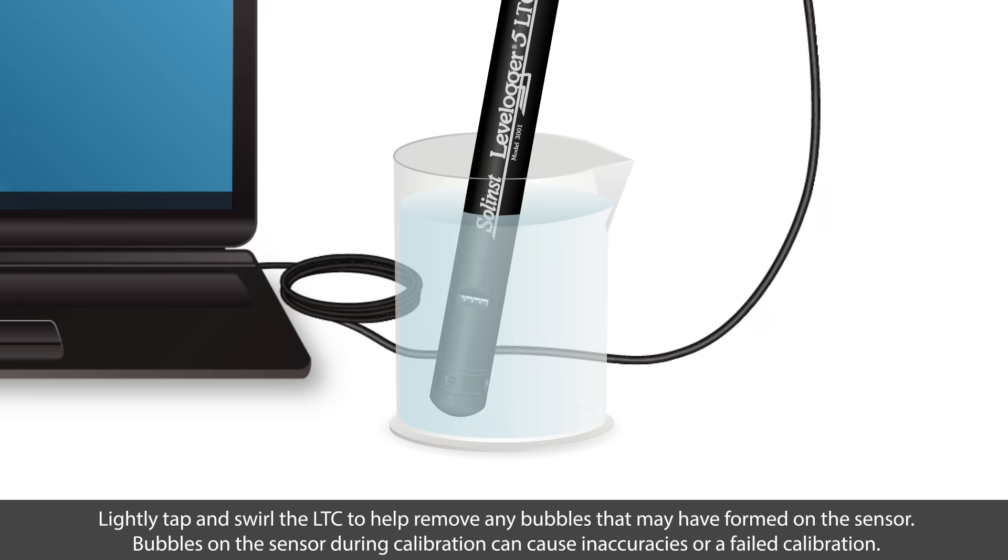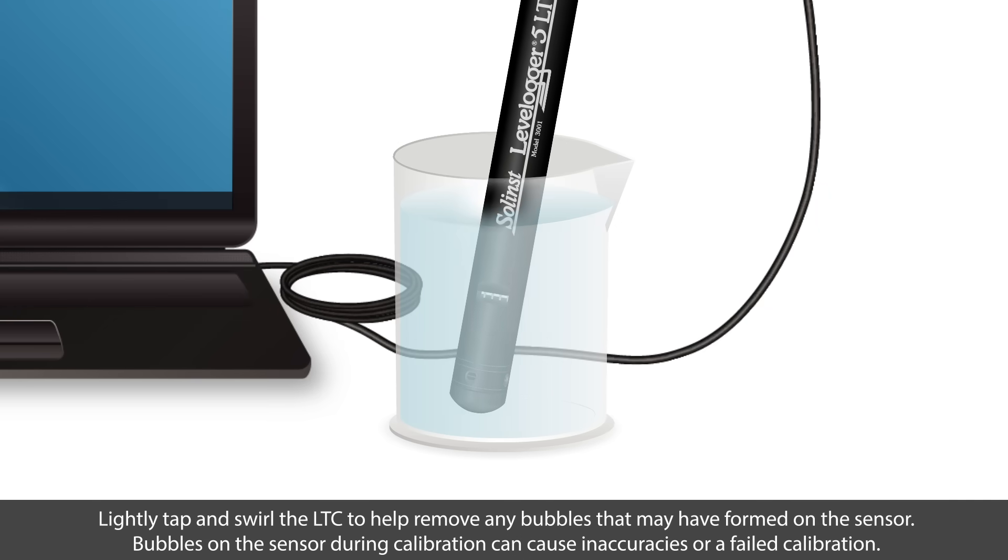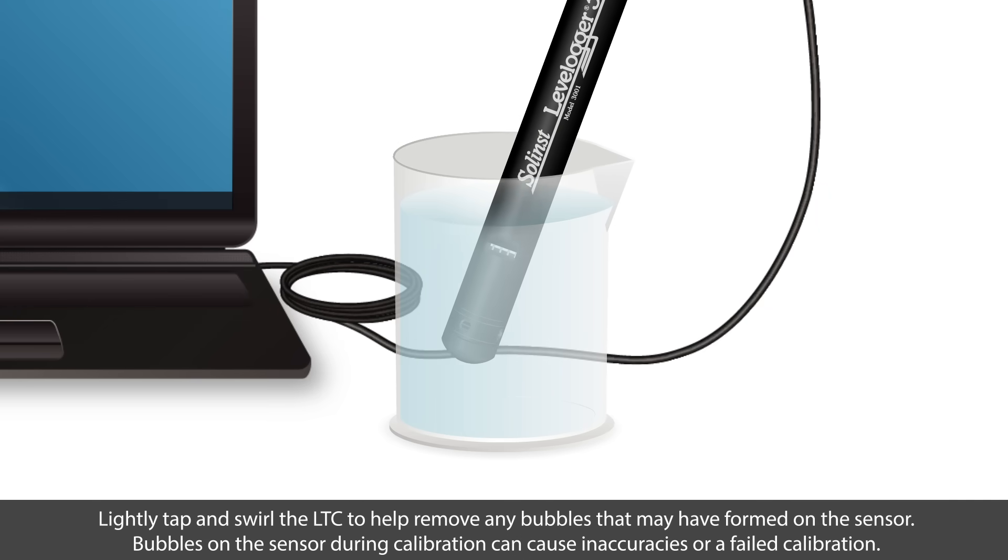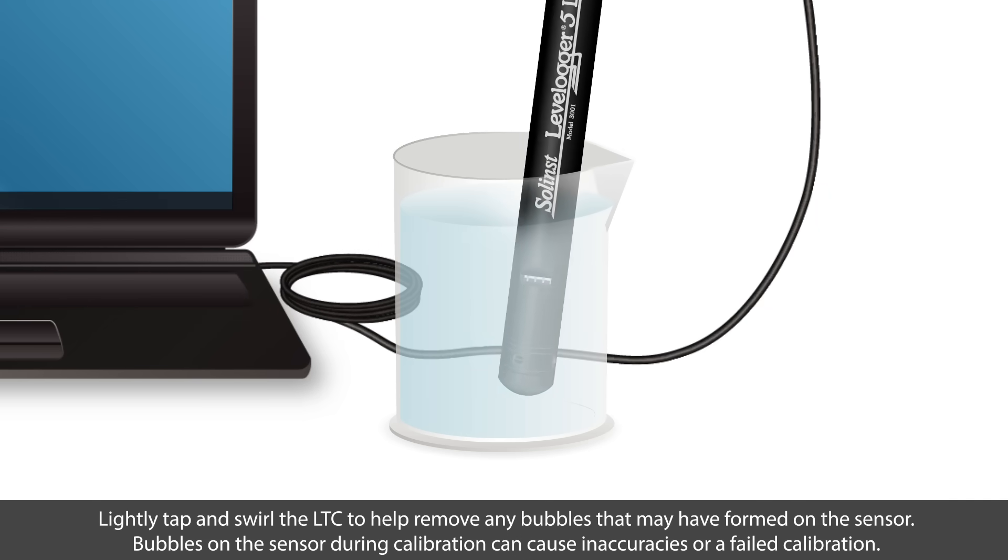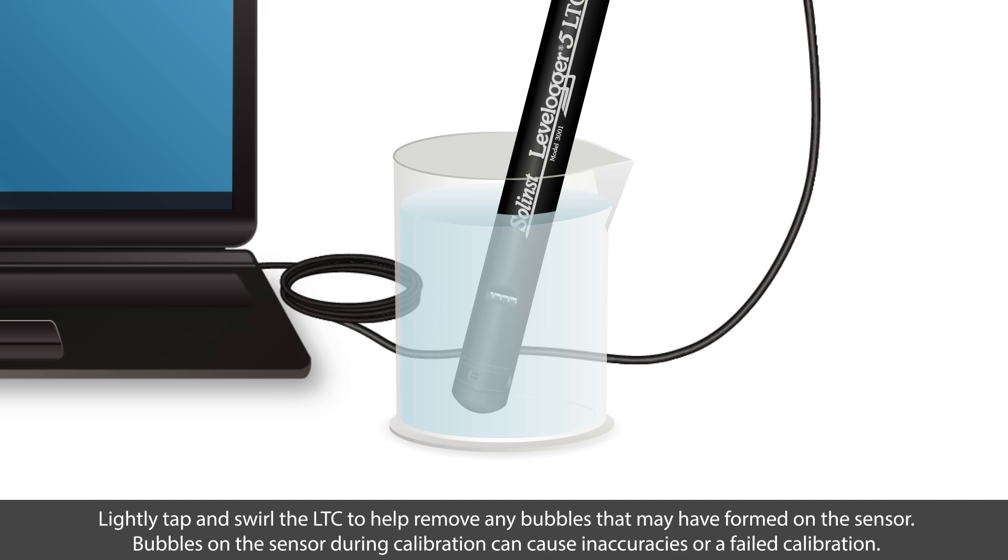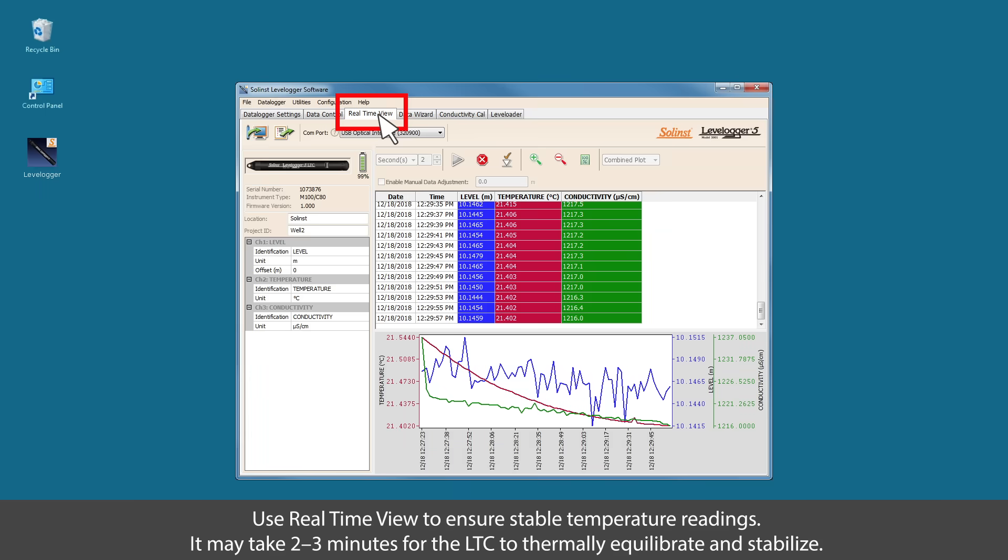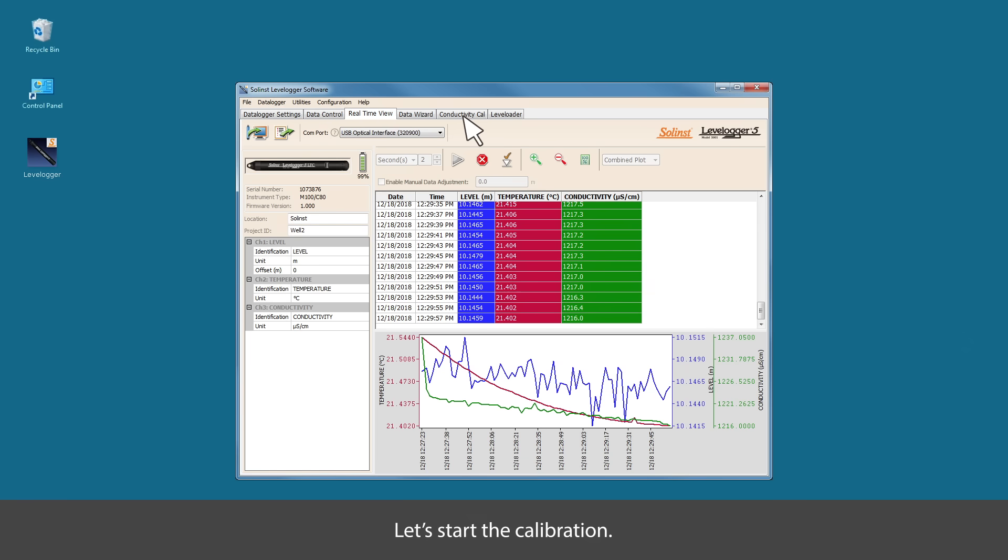Lightly tap and swirl the LTC to remove any bubbles that may have formed on the sensor. Bubbles on the sensor during calibration can cause inaccuracy or a failed calibration. Use real-time view to ensure stable temperature readings. Note that it could take up to two or three minutes for the LTC to thermally equilibrate and stabilize. Let's start the calibration.